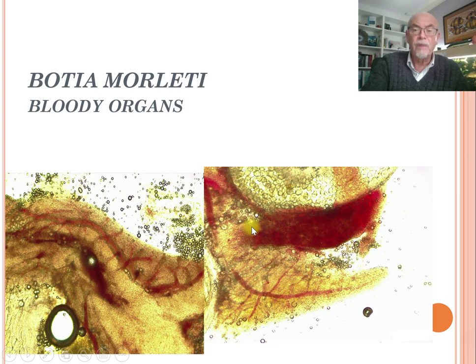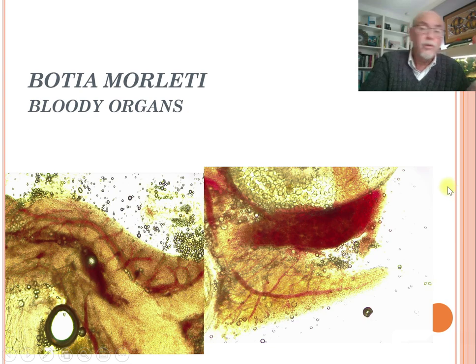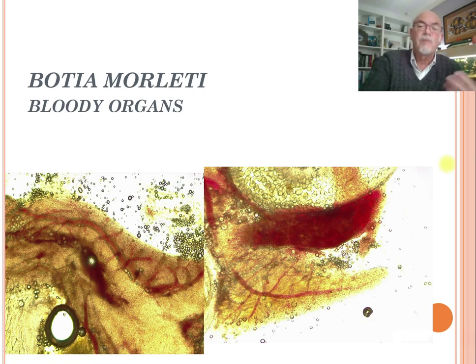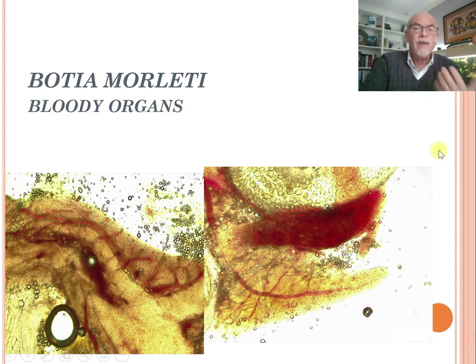The internal organs in this fish were also bloody. The bloody spots we saw on the outside of the fish corresponded with bleeding inside. Here you can see a very heavily affected spleen with bleeding and red markings inside. The liver also has very red markings. We might suspect bacterial infection — it could also be viral — but we have no tools to examine viral infections as it costs too much money and time. We can only treat bacterial infections with antibiotics; the bacterial infections often come secondary after viral infections, and we can only strengthen the fish to fight off the viral infection and become immune.